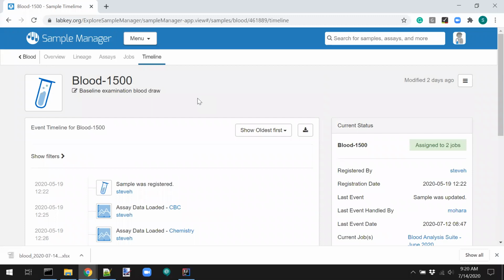That's just my quick browsing. I'm sort of in browsing mode here. I've noticed I haven't really done anything yet with a sample. I've just sort of looked around to give you a sense of how it's all laid out. Any questions or anything from the chat, Jason? There is one, and you partly covered this, Steve.